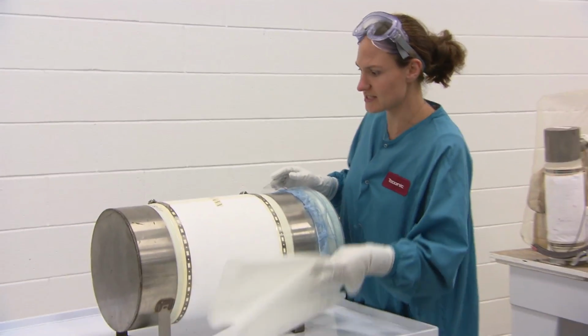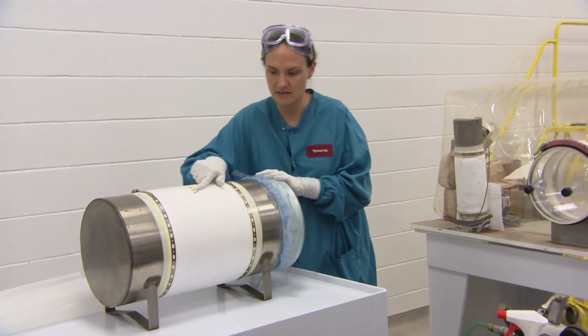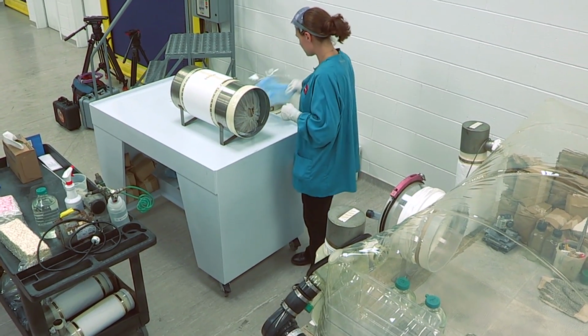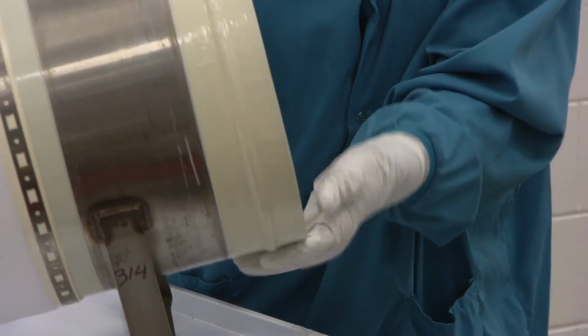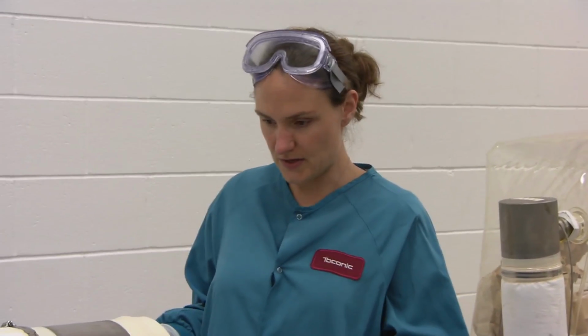Each of our cylinders has 3 indicators that it has been sterilized properly. The first is this autoclavable tape. These strips first start out white, and once they've been autoclaved, they turn black. And then right in the front here, we have a stera gauge. These start off white and have turned black, so we know that this has been sterilized properly. Within the cylinder, within either a bag of bedding or a bag of feed, we're going to have another sterilization indicator that, once we pull the supplies into the isolator, we're going to check to make sure that everything has been sterilized properly. So all of our visuals for now look good.